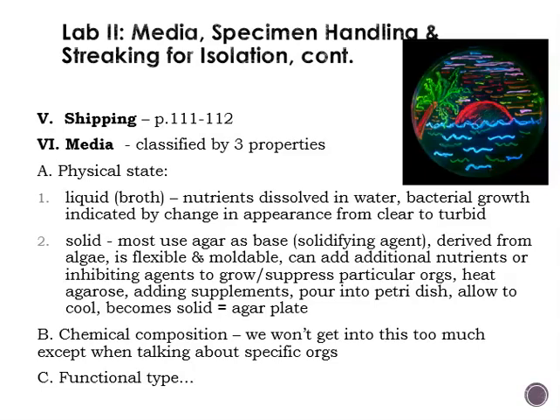And then semi-solid are also available, but we won't really go into it because we won't really be using it in the lab. Okay, if we're categorizing based on chemical composition, again, we'll go into this more as we're talking about specific organisms. Certain organisms, like I mentioned a few minutes ago, especially fastidious organisms that are a little bit more finicky about their growth environment, that's where you'll see the chemical composition of the media change.